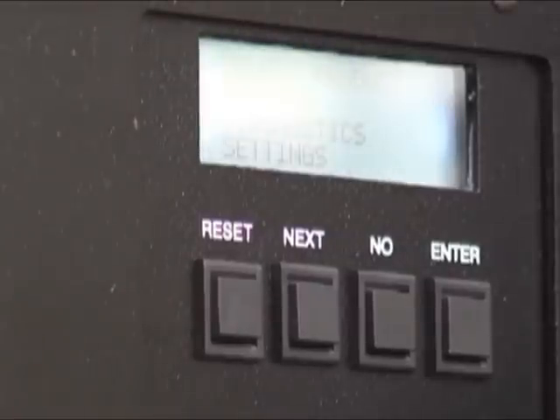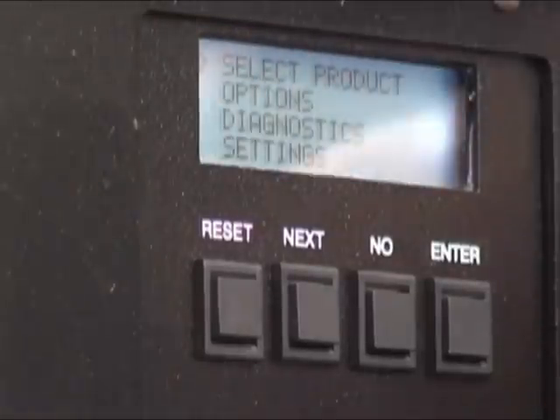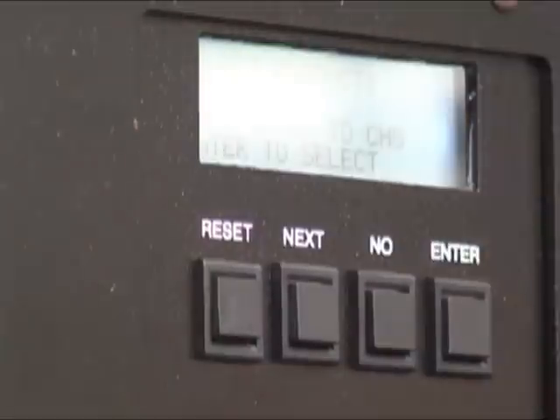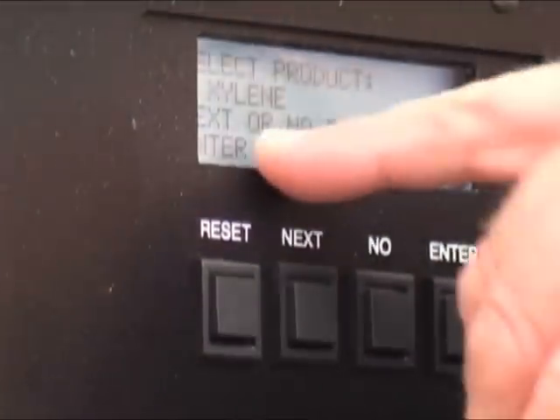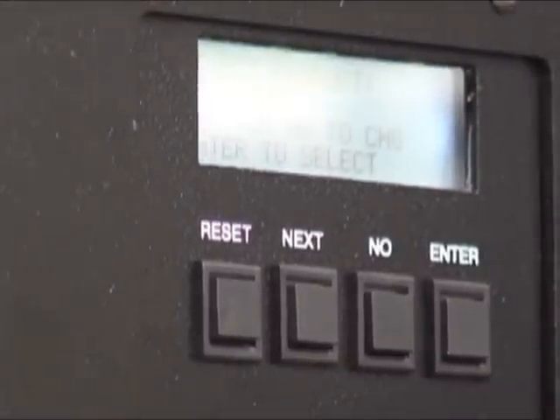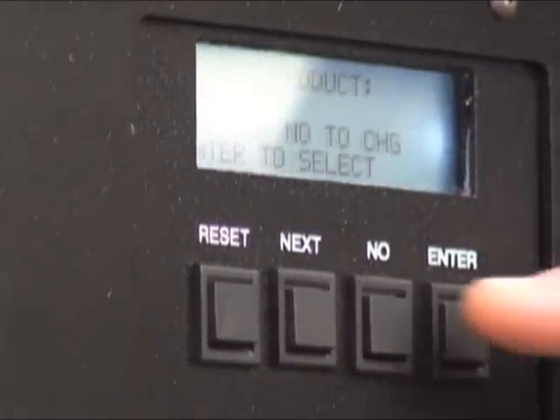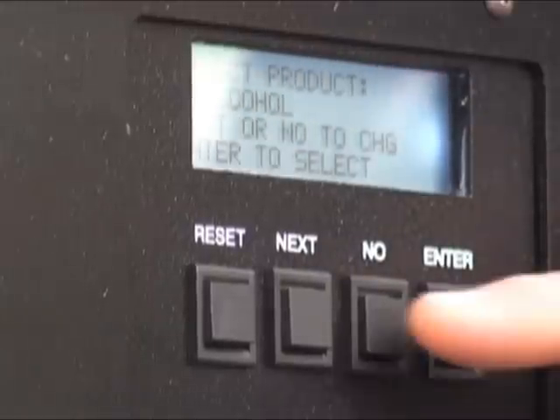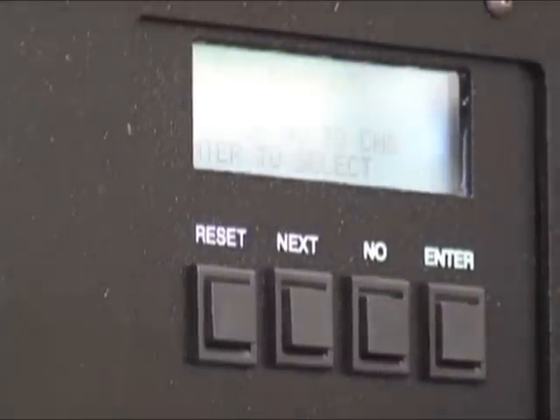You want to pick what you want to do — select a product and press enter. It shows select product — xylene, because that's what it's set for. It says next or no to change, enter to select. If you don't want xylene, simply press no. There's alcohol. If you don't want alcohol, press no again. It goes back to xylene, and that's what this is set for at the moment.